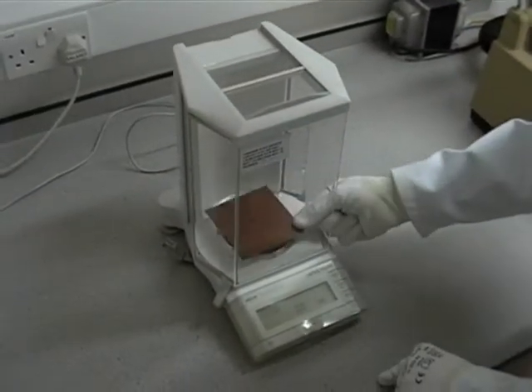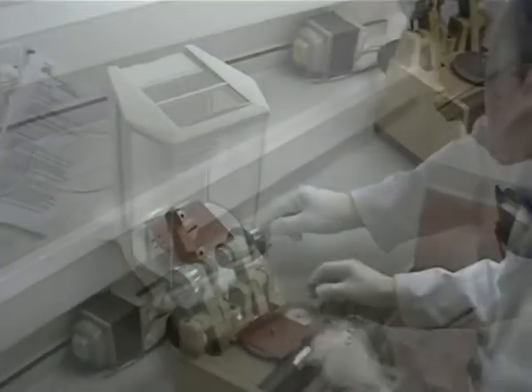The fresh sample must be weighed to a high degree of accuracy before being inserted into the equipment.